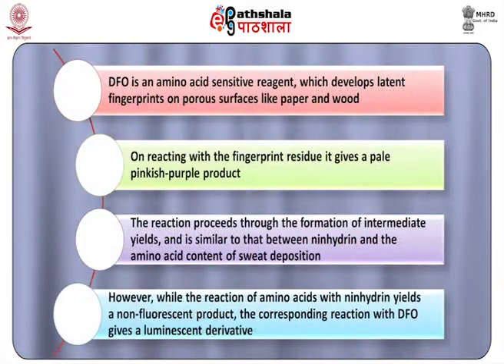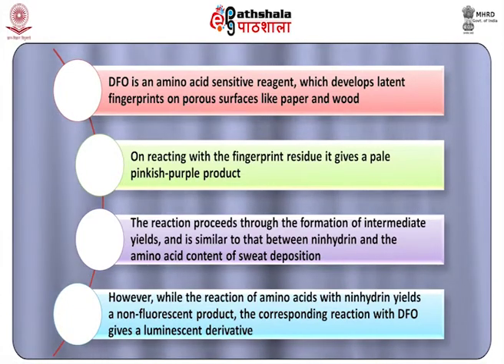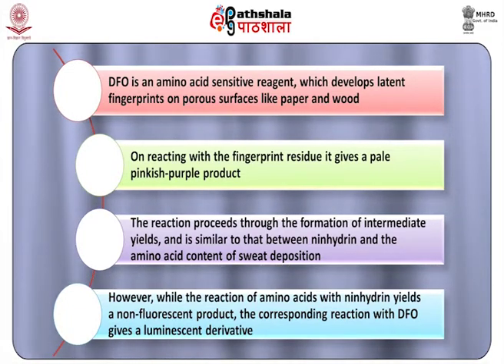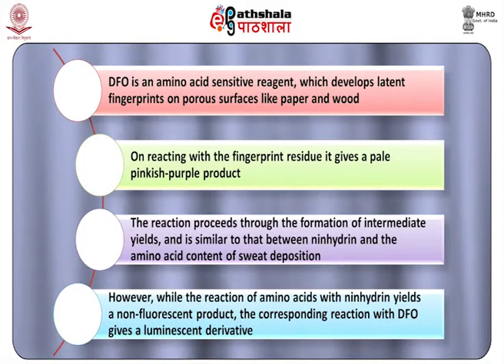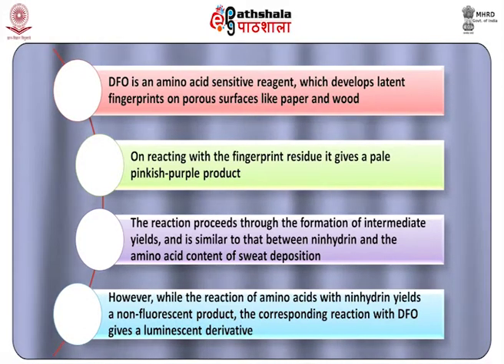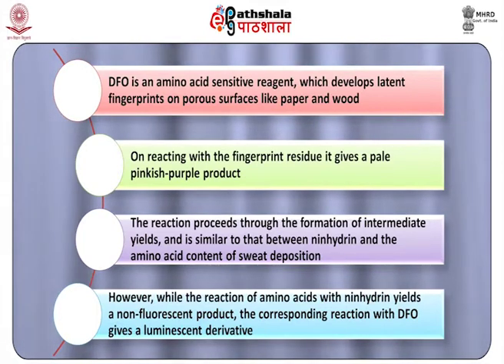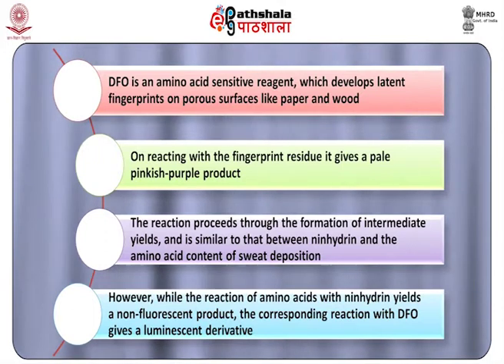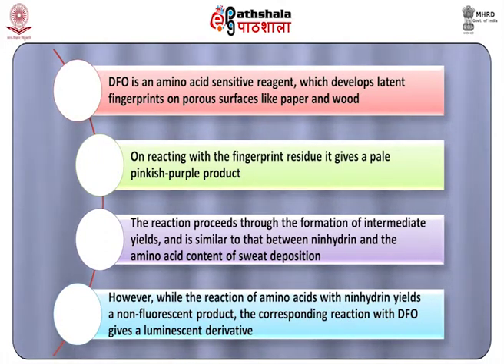DFO is an amino acid sensitive reagent which develops latent fingerprints on porous surfaces like paper and wood. On reacting with the fingerprint residues, it gives a pale pinkish purple product. The reaction proceeds through the formation of intermediate yields and is similar to that between ninhydrin and the amino acid content of sweat deposition.